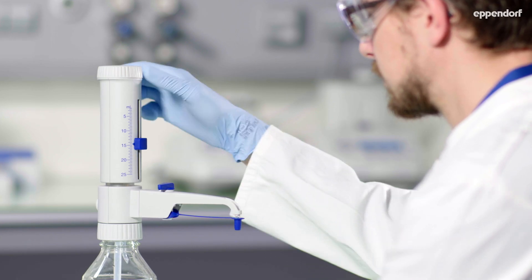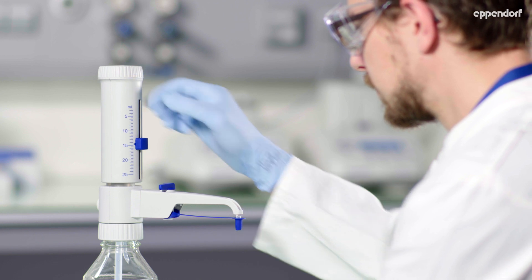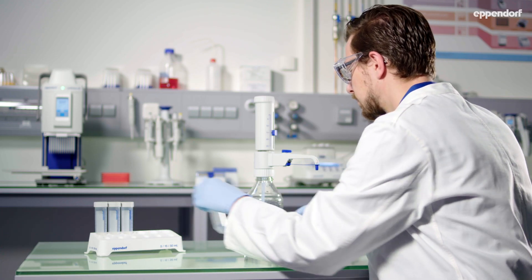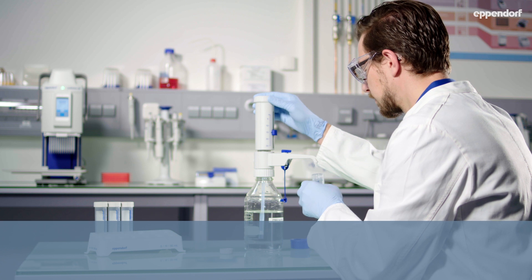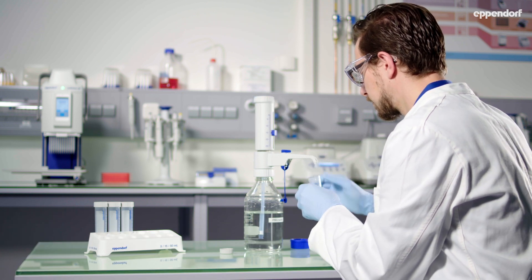The Verispenser 2X has a recirculation valve used to remove air from the system without reagent loss before dispensing the desired liquid volume. Your liquid dispensing will be accurate from the first stroke on.